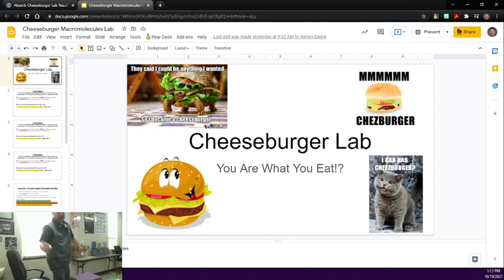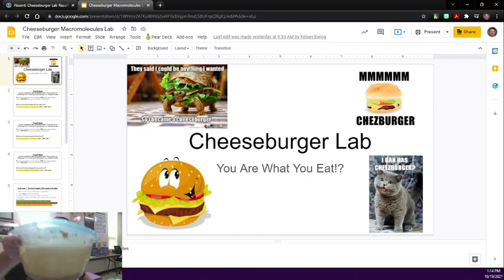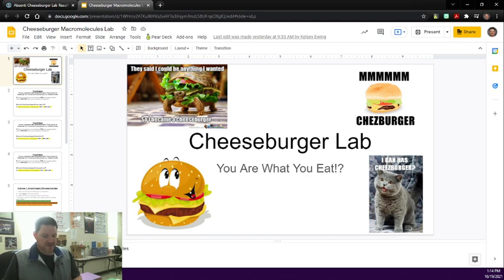Let me go run and grab one of them so you can see the slurry mixture. I am still here. I'm just running to go and get something. I'll grab the grossest one just so you can see it. It's been sitting out for a little bit, so it's been kind of liquefied here. But here, for example, is the liquefied hamburger with the actual chunks at the bottom, and it's kind of separated because I haven't stirred it in a little bit. But that is what we'd be testing: liquefied versions of each ingredient.